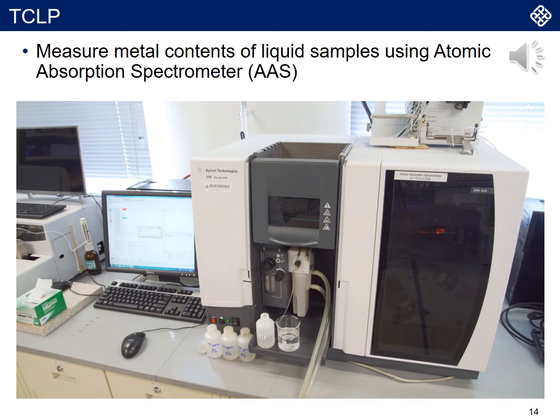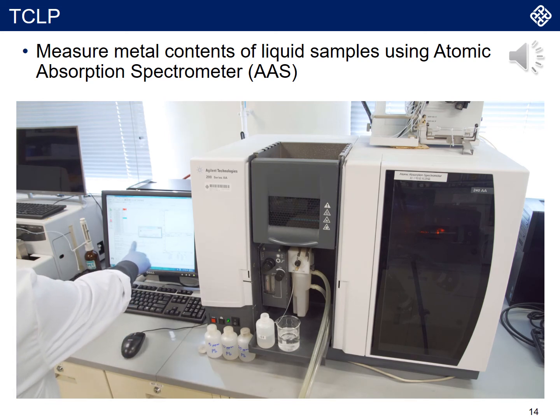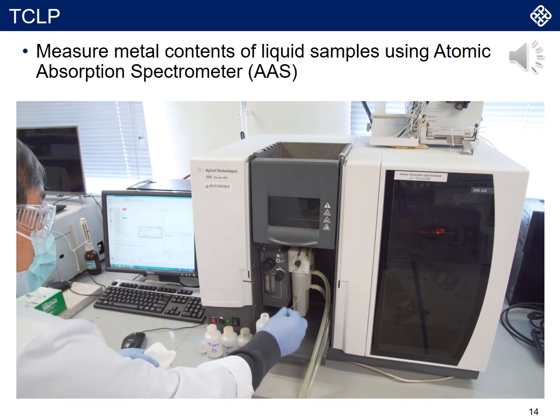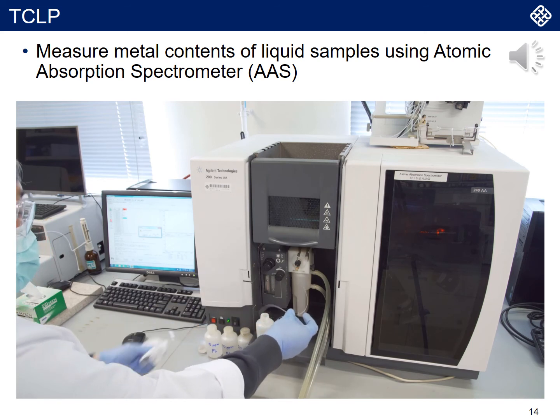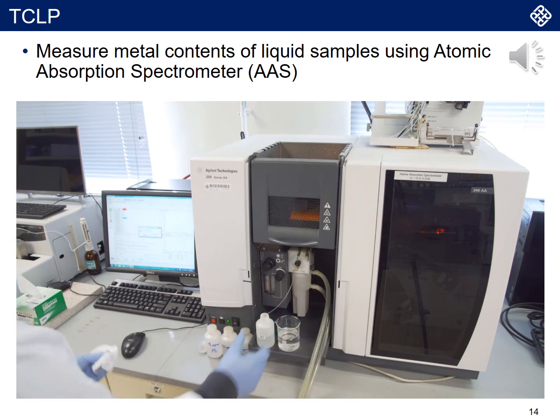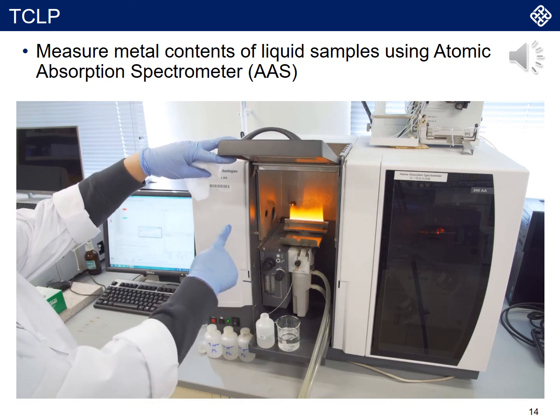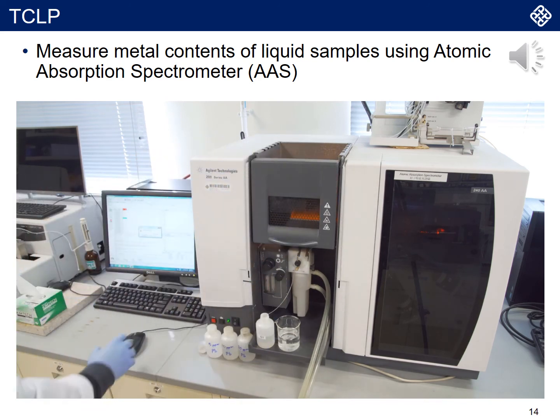Okay, so I think right now the whole measurement has been accomplished. Also, this is the preparation phase. Now the real sample is going in, so you can see the fire, and the measurement of the real sample starts. We are going to repeat that a few times.